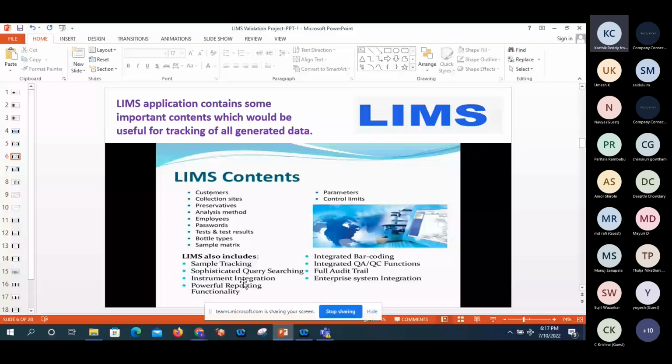For example, there is lot management. Lot management covers raw material, packaging material, in-process, and finished product, so people working in quality control can easily understand it. These can be introduced once testing is completed and handed to the end user, so people can easily understand the life cycle one by one.